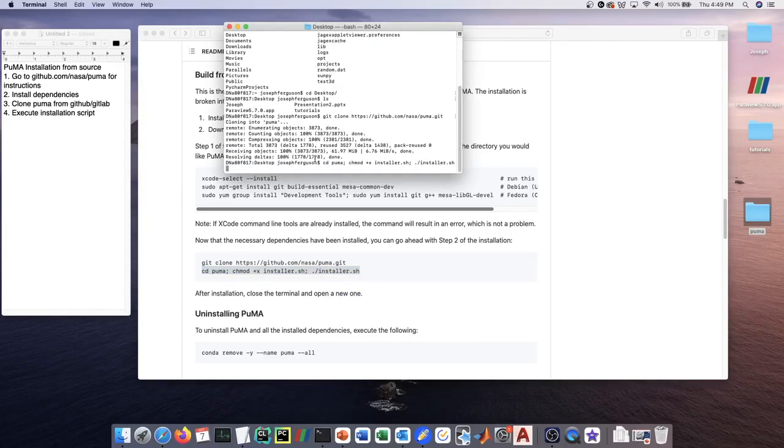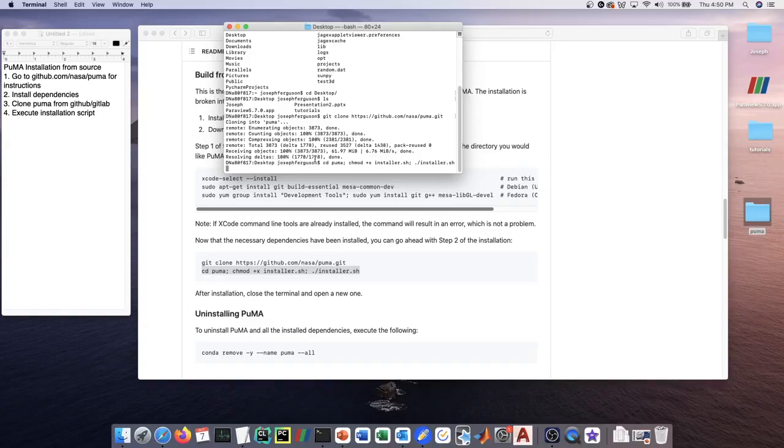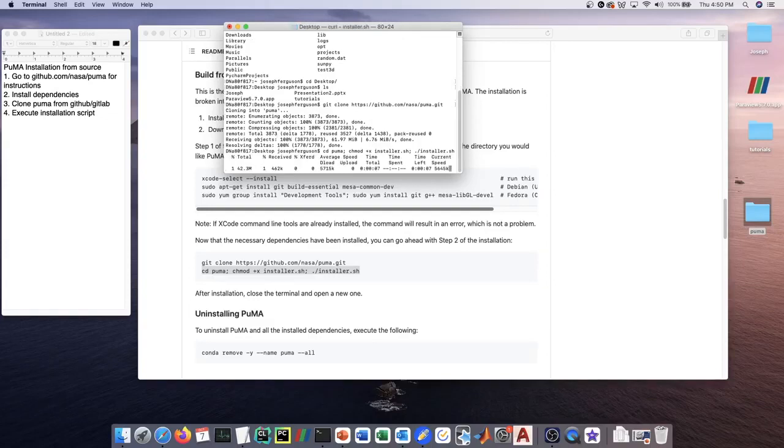The very first thing that this install script is going to do is make sure that you have a distribution of conda. If you do not have a distribution of conda, it's going to automatically install one for you. There's going to be absolutely no user input whatsoever needed between now and when the software is finished installing. I'm going to go and click enter here.